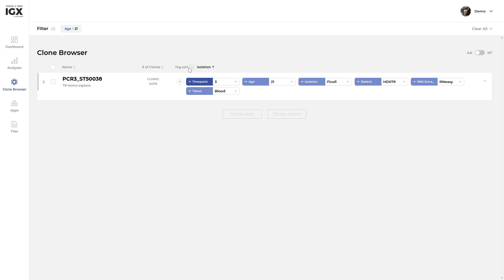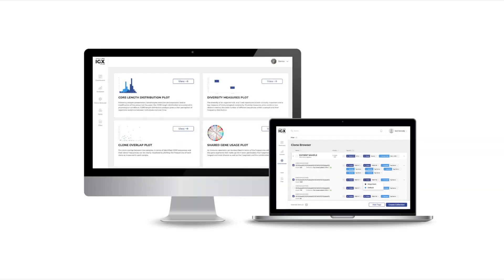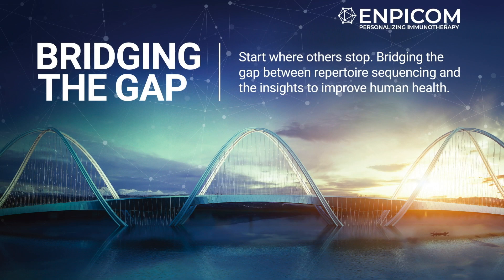This brief overview of the clone browser shows how the IGX platform takes the hassle out of organizing your repertoire sequencing data, and helps you to discover crucial, powerful insights quickly and efficiently.